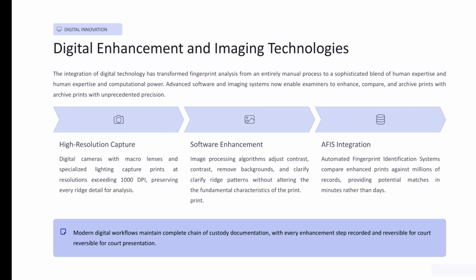From powder dusting to cyanoacrylate fuming to cutting edge optical imaging, fingerprint development has evolved into a sophisticated science combining traditional techniques with modern technology. These methods continue to solve crimes and deliver justice.